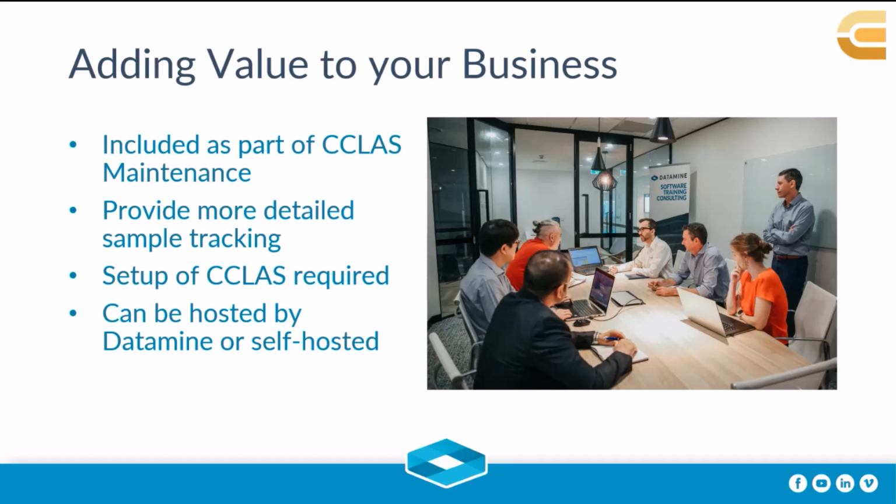And obviously the mobile app platform allows you to better track your samples from field, through sample prep, through the laboratory and onto storage if you wish to do that. You don't have to do that whole process. It's really where you see the best use case for this product for you and your laboratory. CCLAS obviously does require some setup to interface to the mobile app, so a project would be required to assist in this setup. So our consultants are happy to help you with that should you wish to move further.